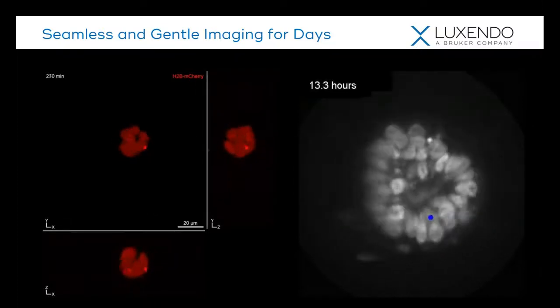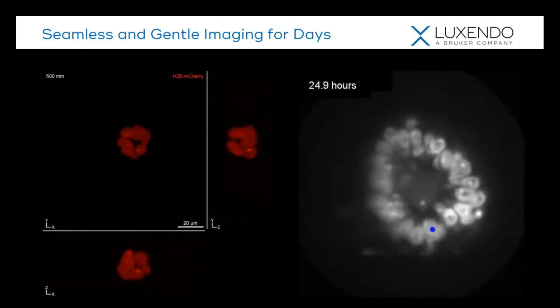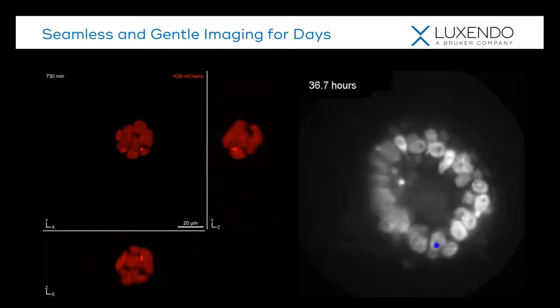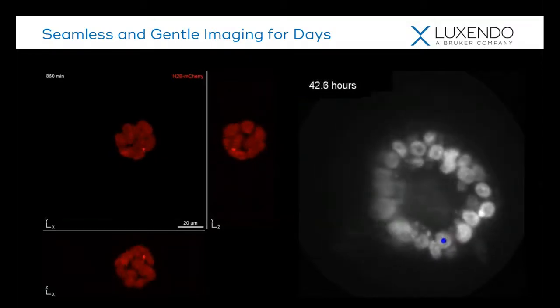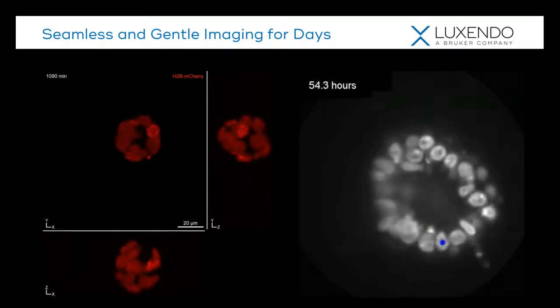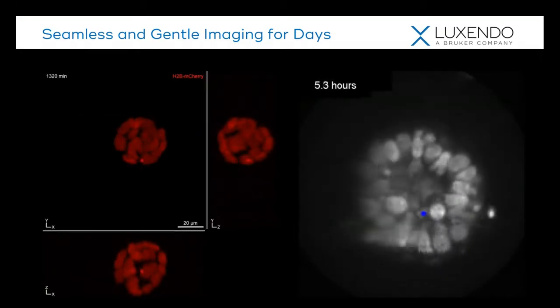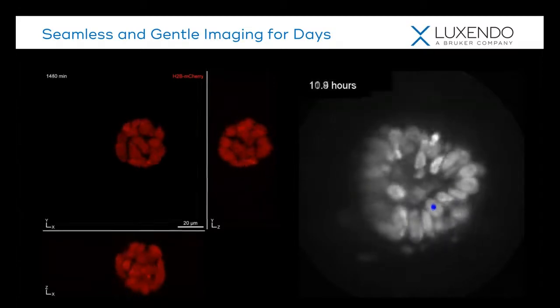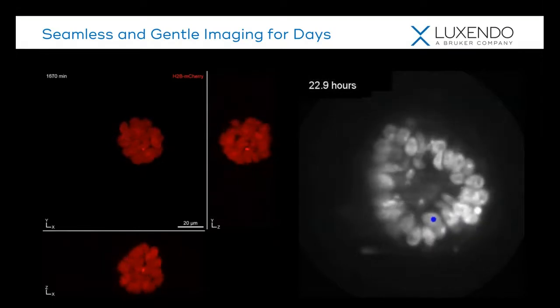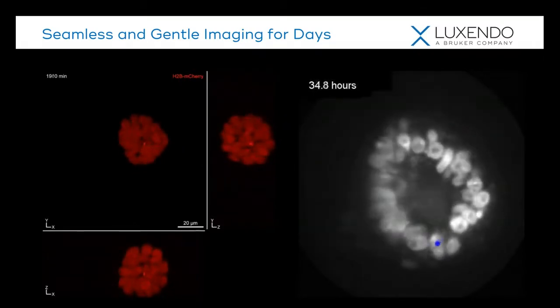And here what I'm showing you on the left is a tumor, and we're watching this grow by actually switching on the expression of an oncogene with doxycycline. And we're going to image this tumor growth for 2 days. And on the right, what I'm showing you is that exact same tumor 2 days later, after we've washed out the doxycycline, turned off this oncogene, and now we're watching this tumor undergo apoptosis. And in fact, the blue cell here, or the blue dot marking the cell, is one of these cells that essentially escaped death and is moving out from the inside of the tumor to the outside.